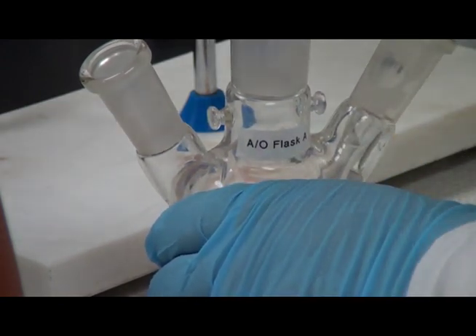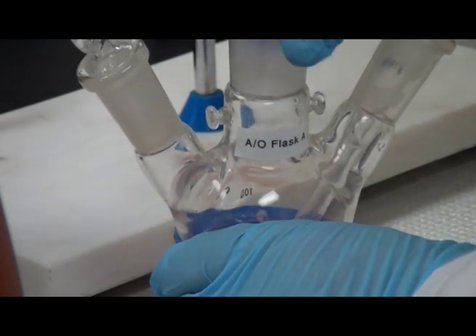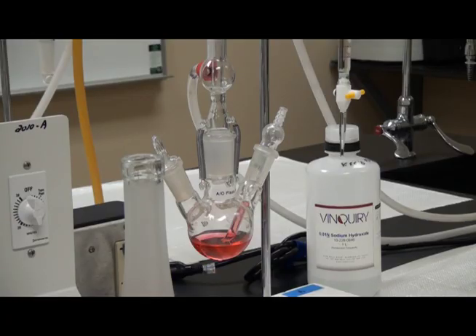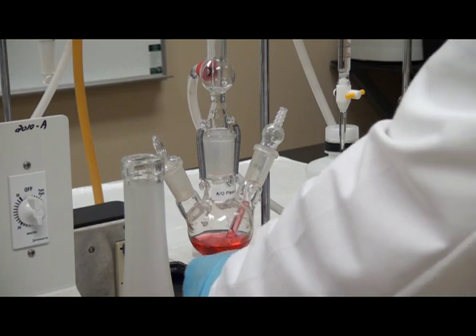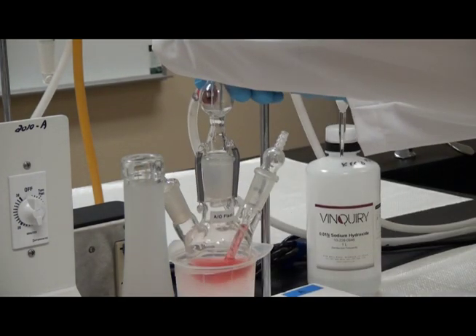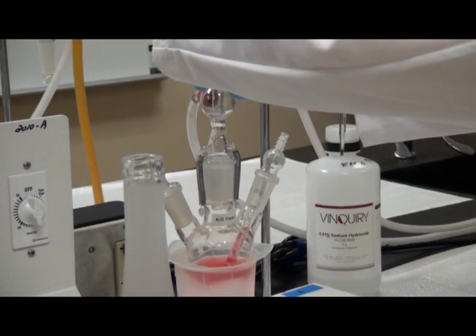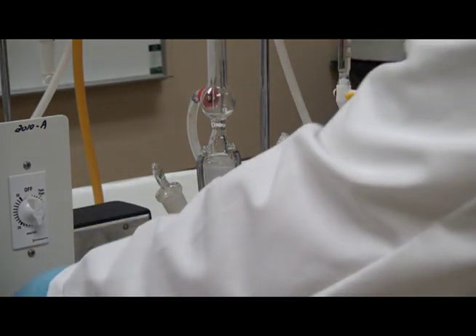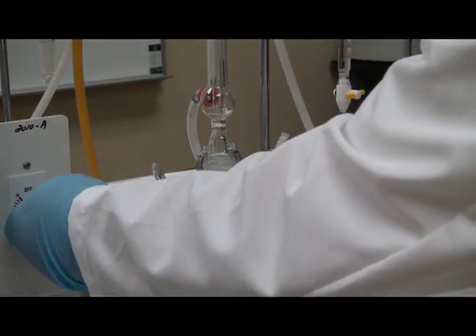Insert the bubbler and stopper into the flask. Connect the flask to the AO apparatus. Turn on the vacuum pump and set the timer to 10 minutes. Aspirate for 10 minutes at a 1 liter per minute flow rate. The dial timer will turn off the vacuum after 10 minutes.